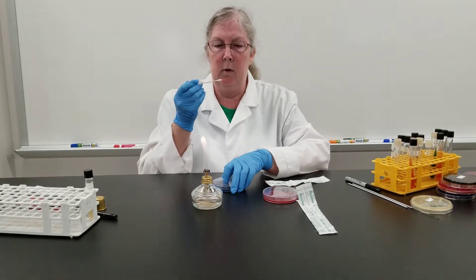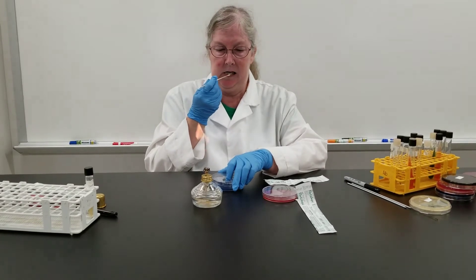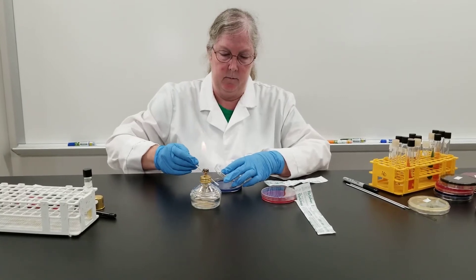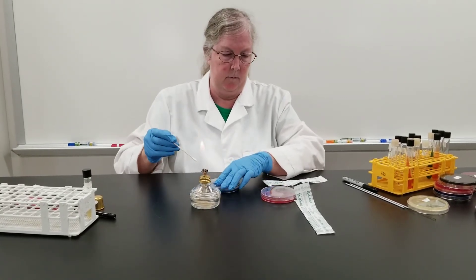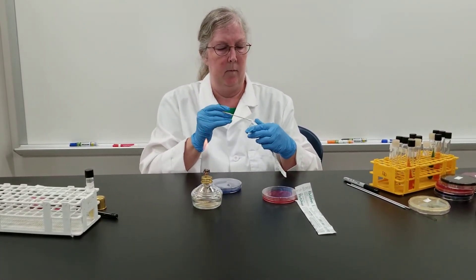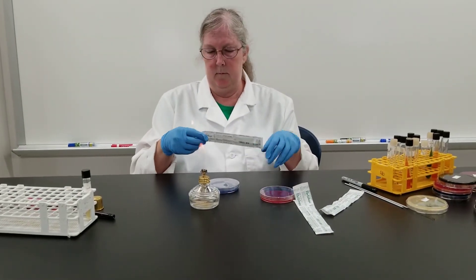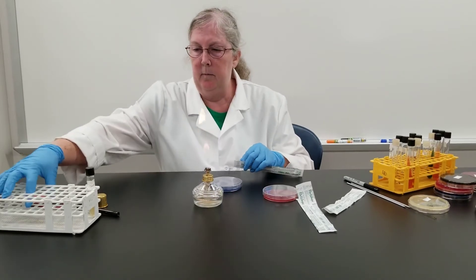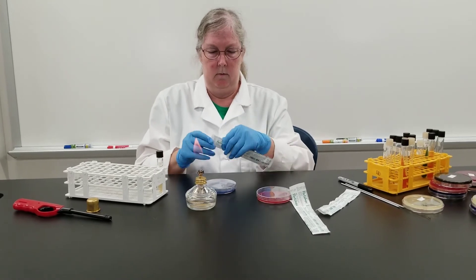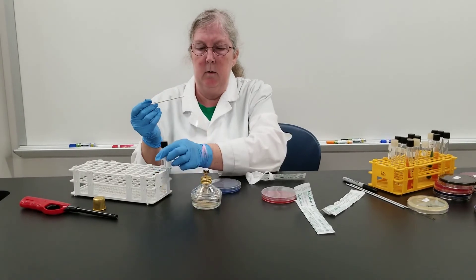For the second swab, I'll be going along the gum line, once again swabbing on the plate. And lastly, I will be inoculating the Todd-Hewitt broth, once again swabbing along the gum line.